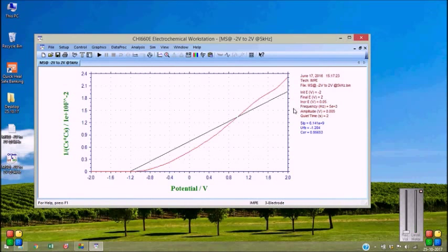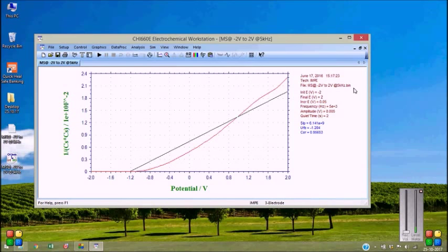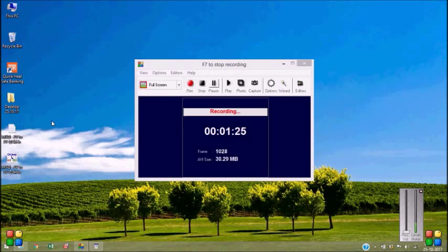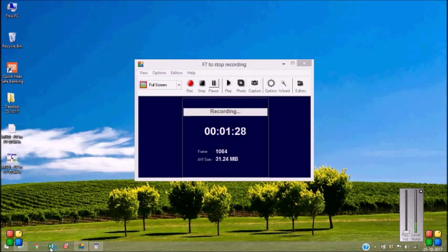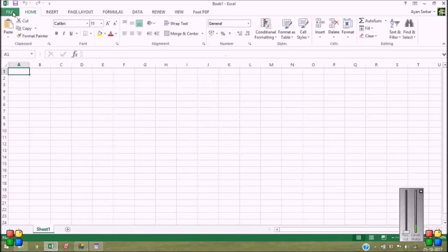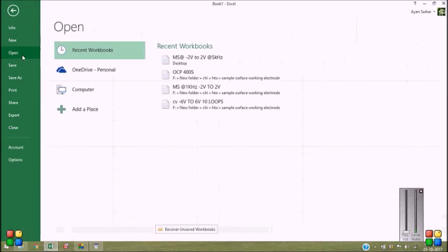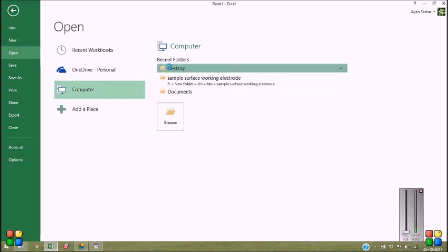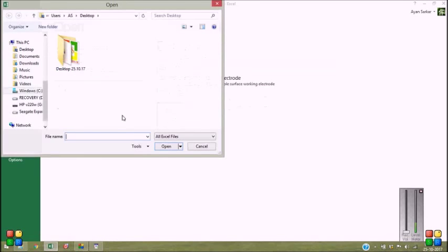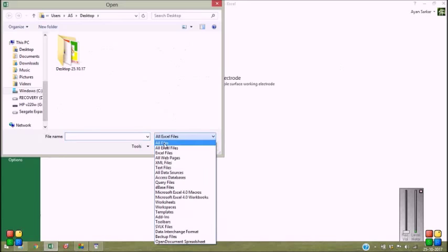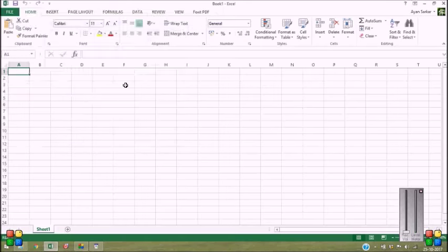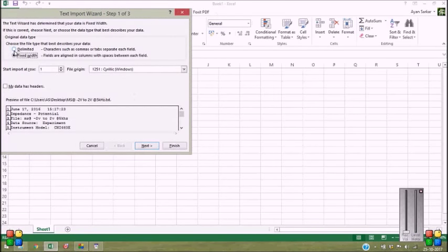However, one thing you should notice that I have performed this Mott-Schottky measurement at five kilohertz of frequency. So I need to open the ASCII file. I need Excel, open, computer desktop, all files, and delimited.